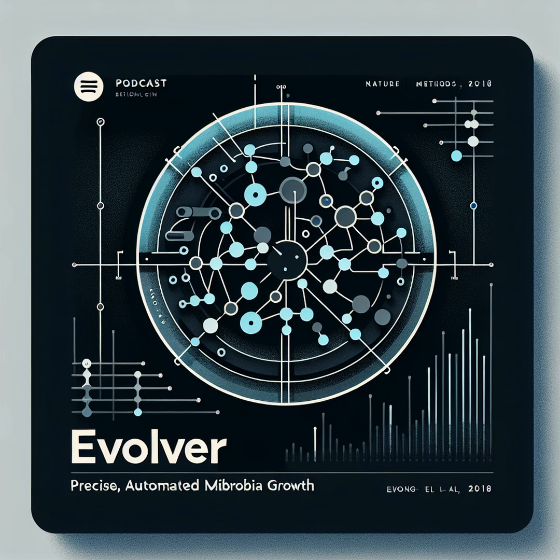And what about the future directions for this technology? What could we expect to see from eVOLVER and similar systems in the coming years? The authors themselves mention the potential for integrating eVOLVER with other automation technologies, such as robotic systems. This would further streamline workflows and enhance the system's capabilities, pushing the boundaries of what's possible in automated experimentation even further. That's an exciting prospect. Imagine fully autonomous labs, capable of running complex experiments with minimal human intervention. eVOLVER is a significant step towards realizing that vision.